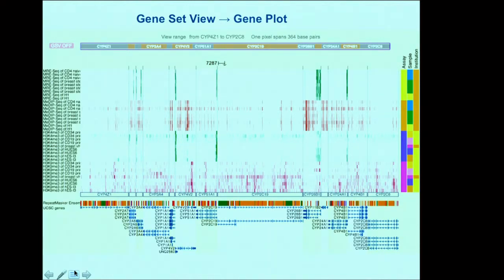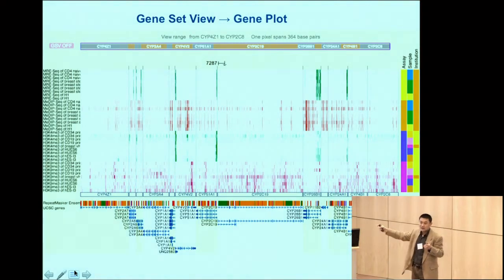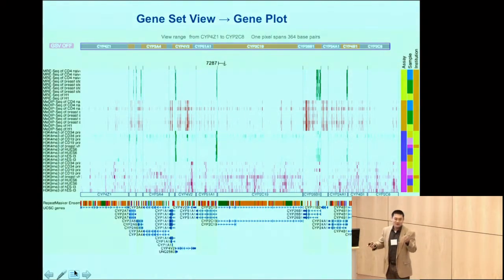You can bring a bunch of promoters together. You can bring a bunch of enhancers together. So the only innovation, if you will, is a simple principle. Couldn't be simpler. That is breaking the genome coordinates, which is linear, a very nice coordinate, moving them apart so that you can bring interesting parts together, right? So we implemented that, and with that, we can do a lot of damage to the data.